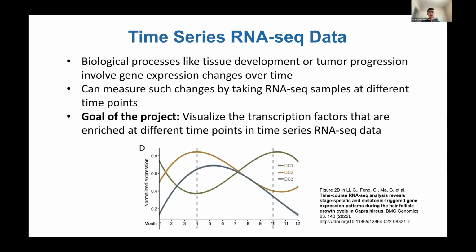Specifically, my project looked at time series RNA-seq data, which is relevant because biological processes like tissue development or tumor progression involve gene expression changes over time that can be measured by taking RNA-seq samples at different time points. Therefore, the goal of my project was to visualize the transcription factors that are enriched at different time points in time series RNA-seq data. And by understanding how the enriched transcription factors at one time point regulate future enriched transcription factors, we can better understand how the transcription factor landscape governing a biological process evolves over time.